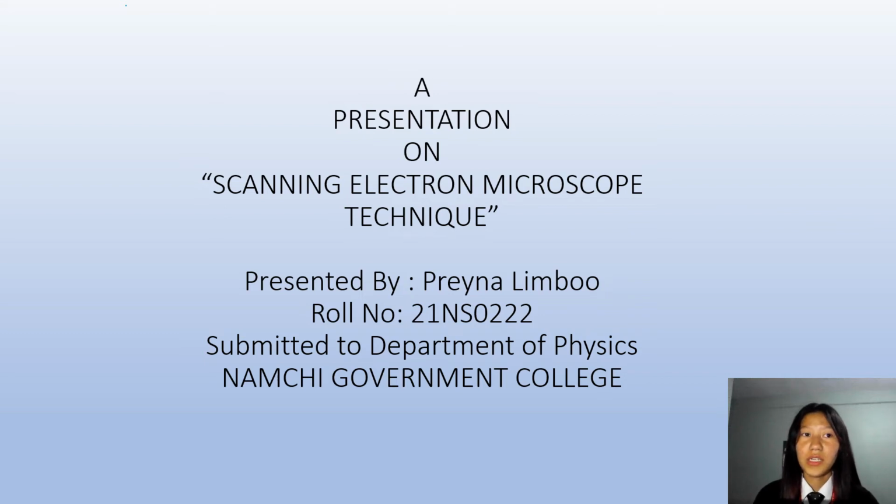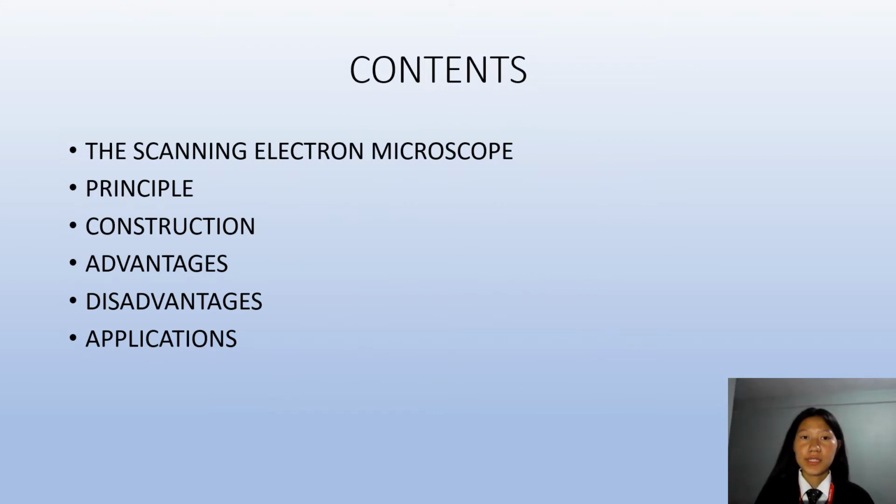Hello everyone, this is the video based on my assignment topic, SEM technique, where SEM stands for Scanning Electron Microscope. The contents of this video are the scanning electron microscope: principle, construction, advantages, disadvantages, and application.